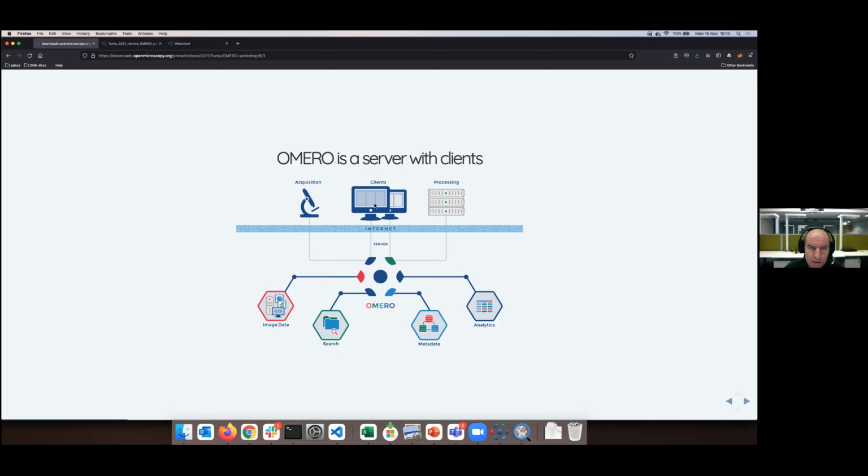It's not where you are. Typically, you don't have physical access, and this is good, because you would just wreak havoc on that hardware. It looks nothing like what you are used to. It's just racks and a forest of wires. It's behind a locked room, and so the server is in our cartoon on this side.